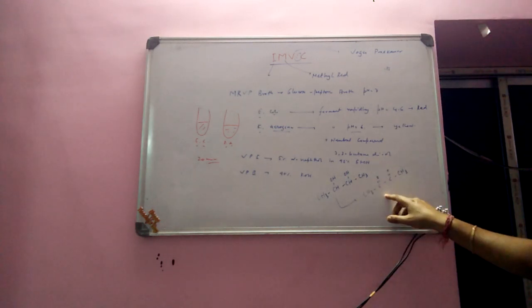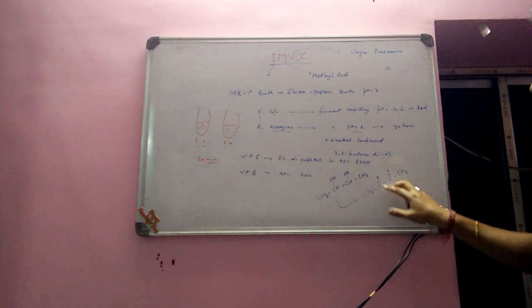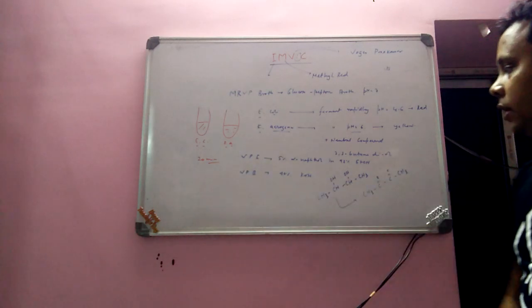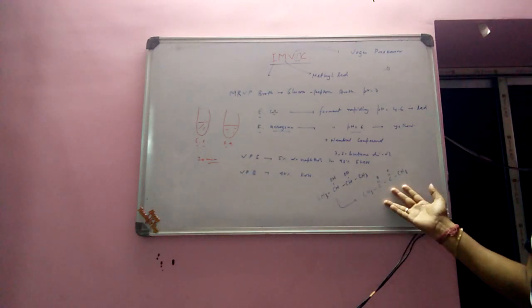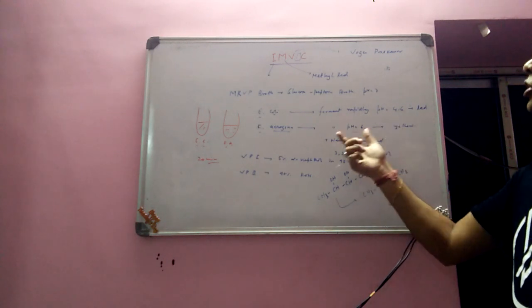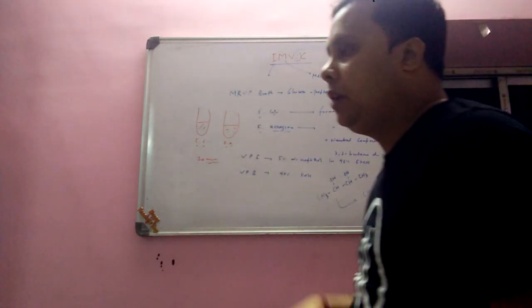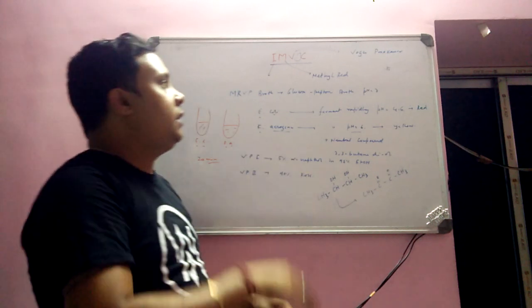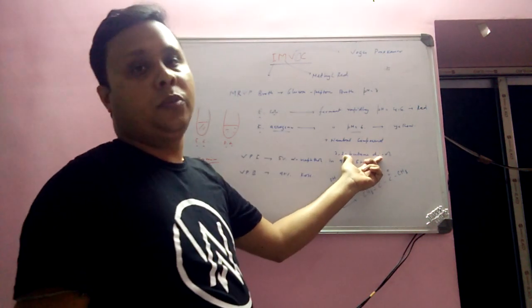This is the oxidized form. 2 hydrogens are removed here. So in the presence of atmospheric oxygen, when we are incubating for 20 minutes, this 2,3-butanediol will be converted to diacetyl, and this diacetyl attacks the guanidine residue of peptone, which ultimately forms a pinkish red appearance. So in this VP test, we are basically checking whether the organism is capable of producing this neutral compound or not.